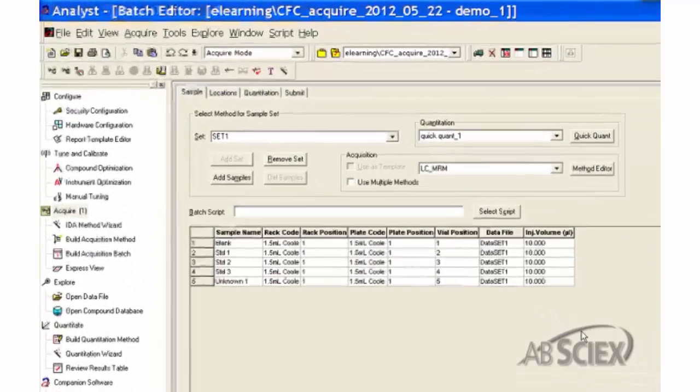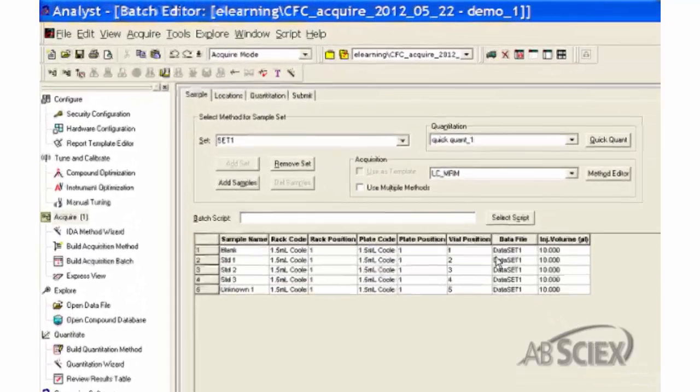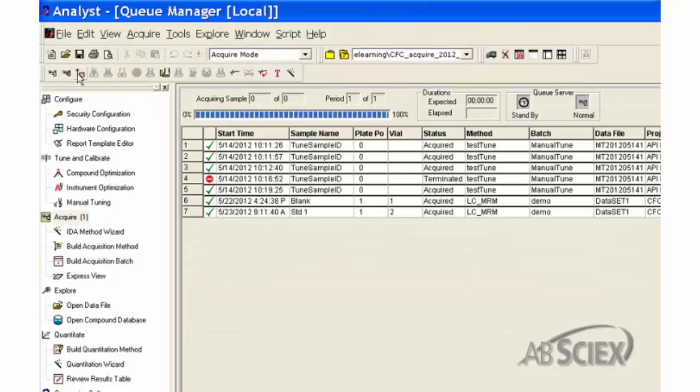To launch the sample queue, click on the Queue shortcut button or choose Sample Queue from the View menu.